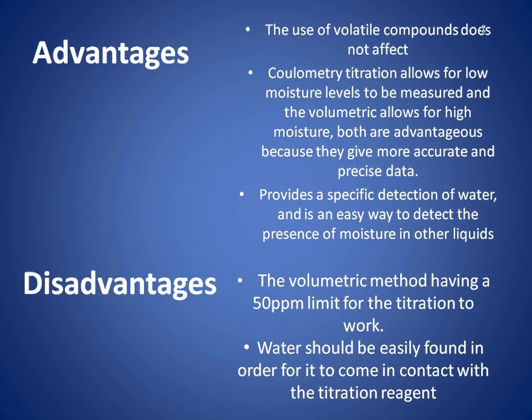When using Karl Fischer, certain things should come into play. The ideal pH is between 5 and 7. Certain reagents should be avoided because they react on the side and cause water consumption and change the endpoints. The sample size should be large enough to get usable data, but not so large that titration time runs long.